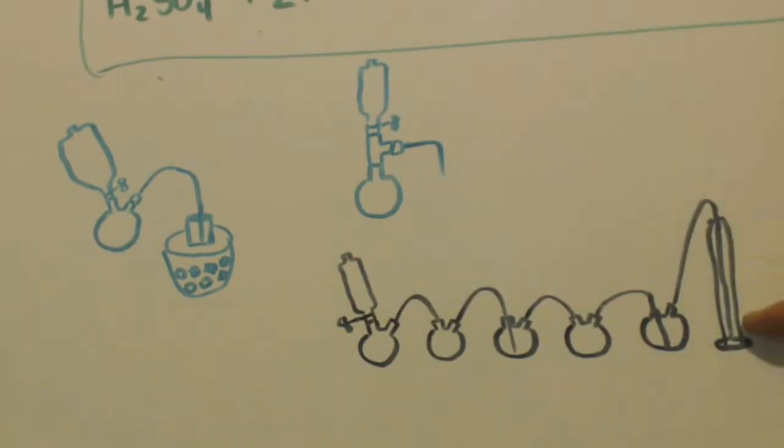So I've got a hose coming, and I've got a graduated cylinder that's 1,000 milliliters, so it's tall. I don't care that it's wide. I want it to be tall. I'll put the hose all the way at the bottom, so it has a real long time before it has to get out to escape. It has more of a chance to dissolve it, you know what I mean? Being that it's so long. Being fat doesn't do anything. Then I'll cover the hose part with some paper towel or something, just in case. It'll have to absorb through the paper towel too.